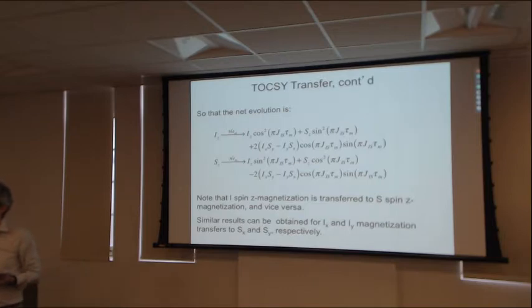That's different from the COSY experiment. The COSY experiment, we only got transfer from one spin to its partner.